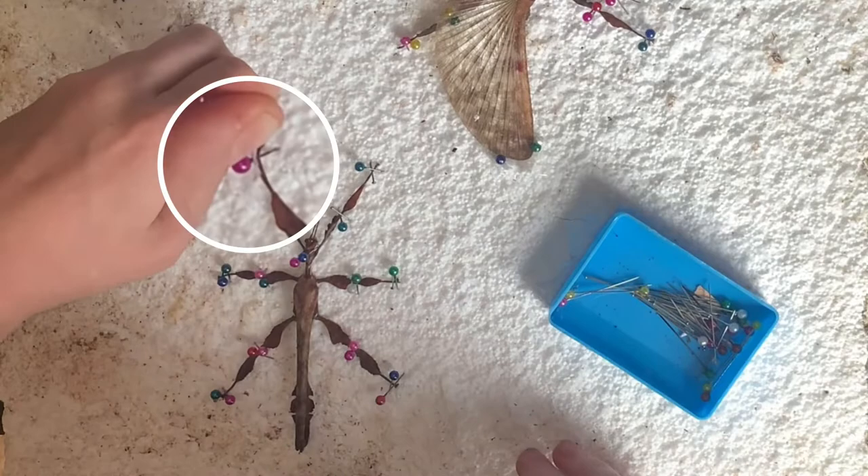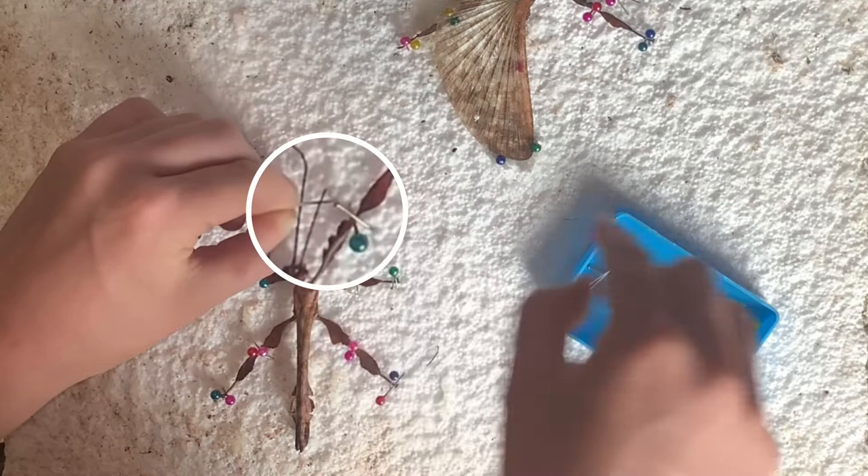Now we can move on to the antennae. The antennae are very fragile, so they must be handled with care. You just want the antennae to be pinned as straight as possible.